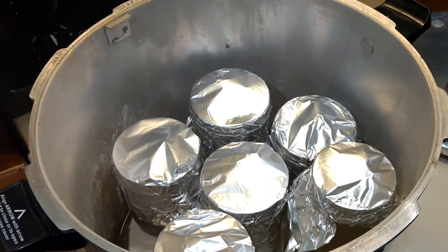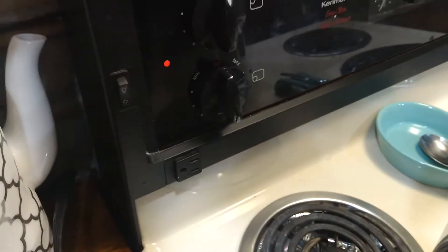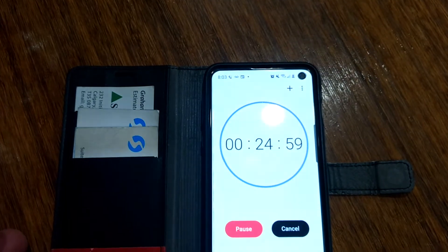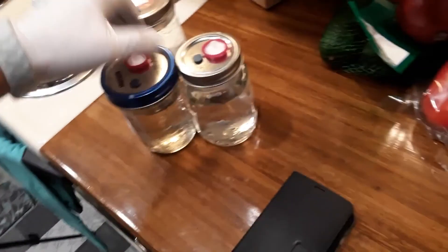Put them in your pressure cooker. Once your 15 psi weight starts rocking, turn it down to medium-high and set your timer for 25 minutes. And that's it — away you go. When they cool down, take them out and they're ready to be inoculated.